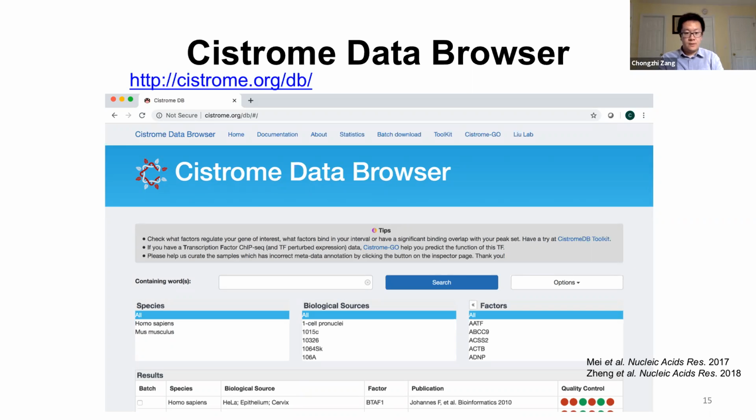They collected from GEO, the Gene Expression Omnibus, which I think is the single largest data repository that contains all the public data. ChIP-seq data published in a paper, we are required to submit the raw data to a public data repository so that the data can be accessible to everyone.